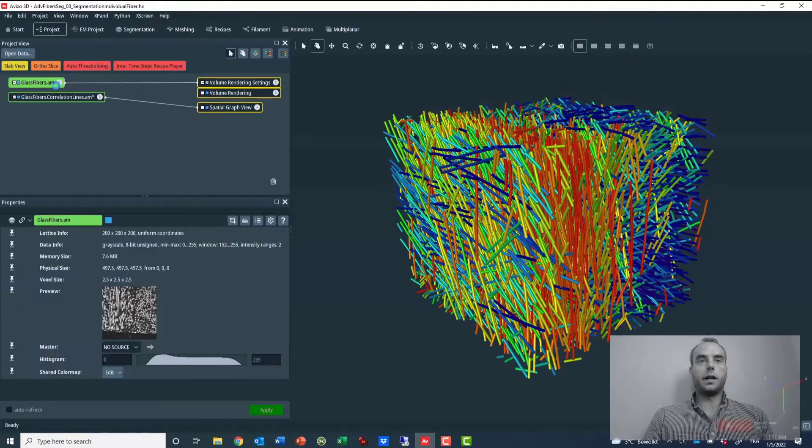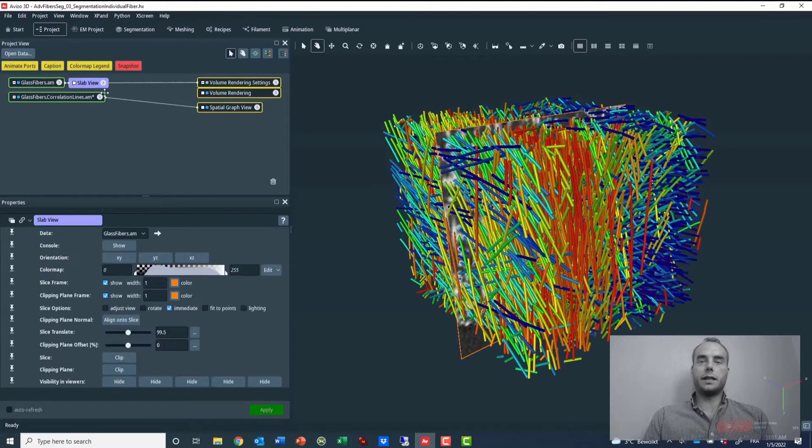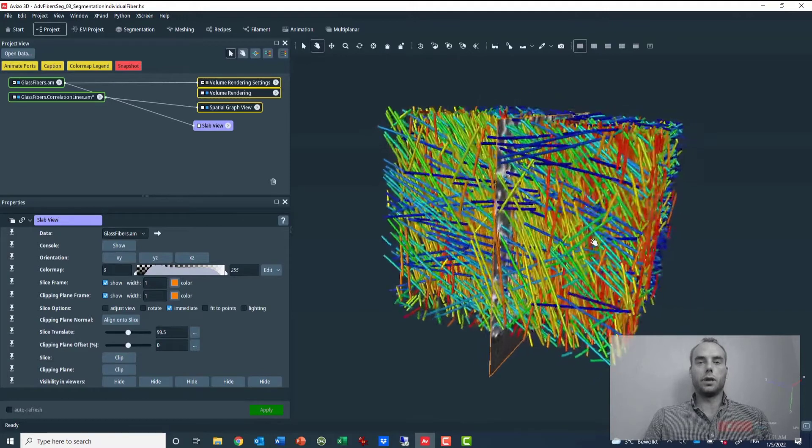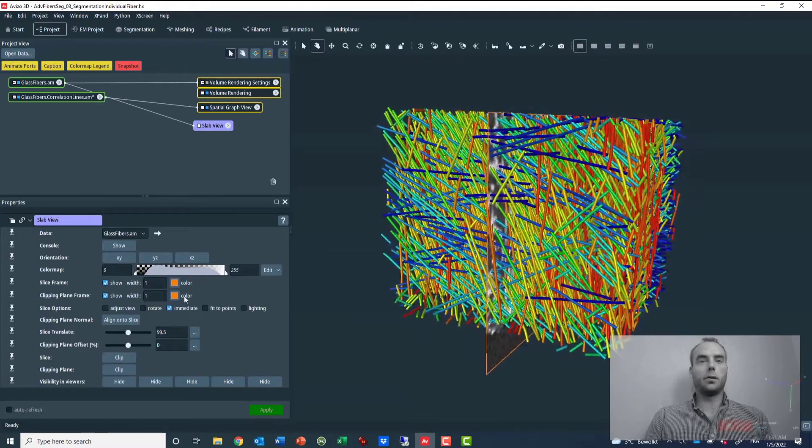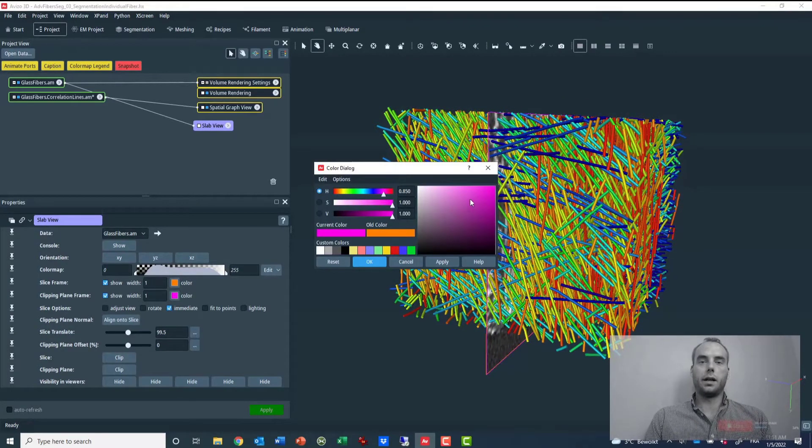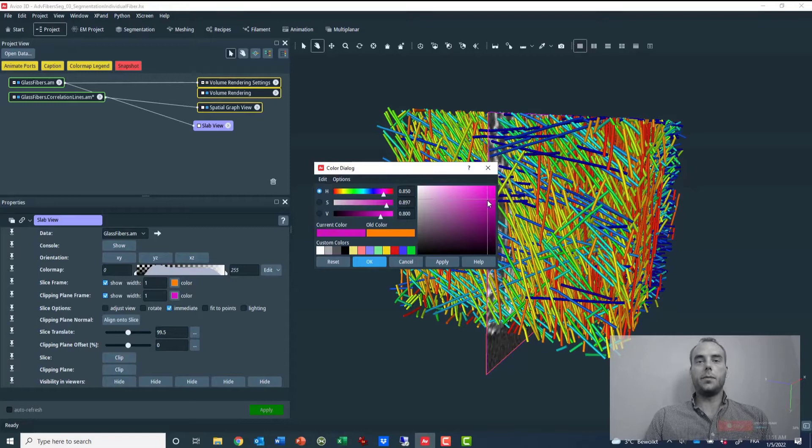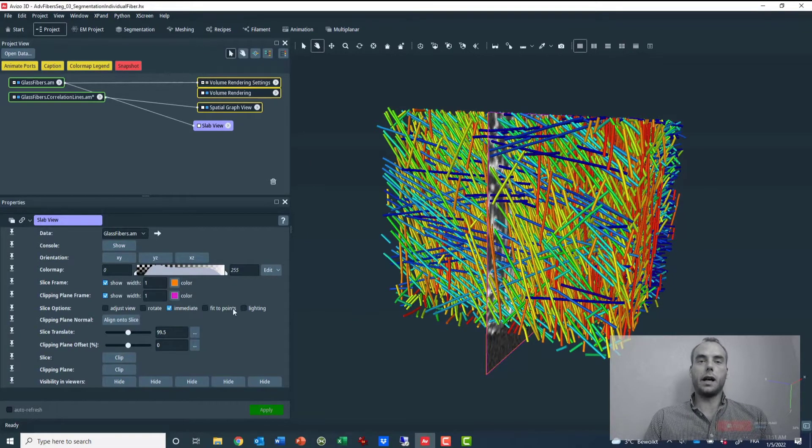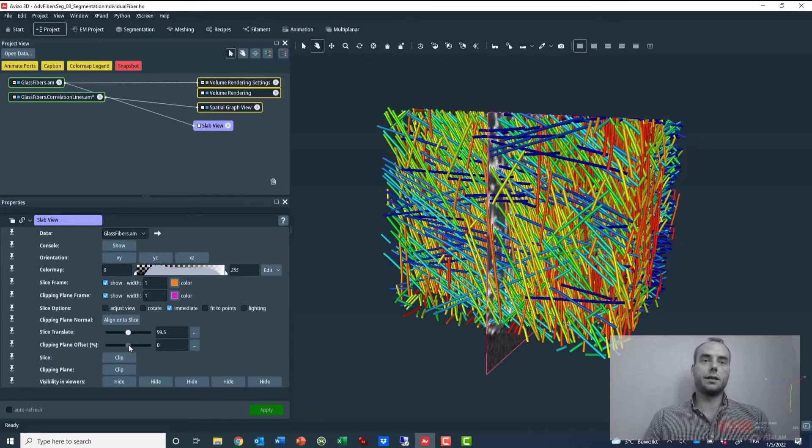So for that I will use instead the SlabView module, which is basically a combination of a slice and a clipping plane. That enables me to set the clipping plane at a fixed distance from the slice.